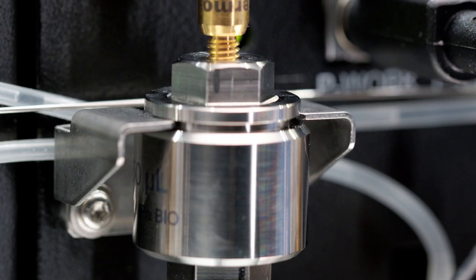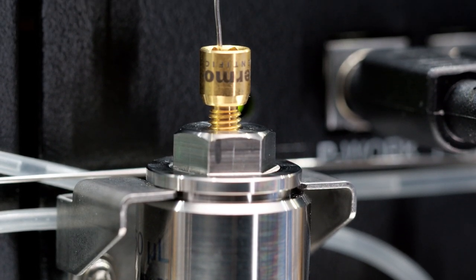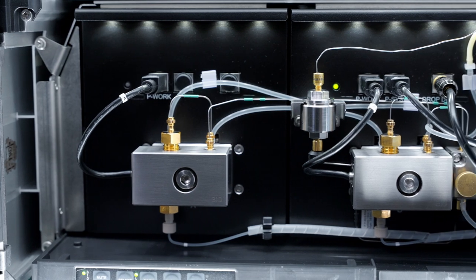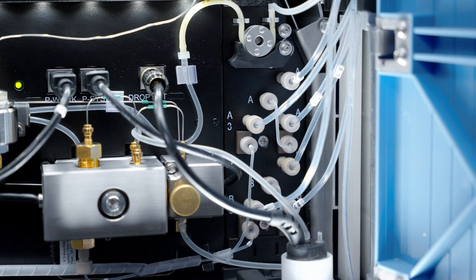Choose between binary solvent blending for high-throughput applications or quaternary solvent blending for routine applications and flexible method development.